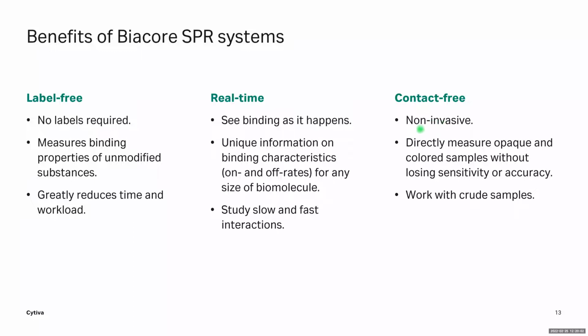We can work with fairly complex sample mixtures, samples that may be resistant to letting light pass through them, because for SPR to work, light only needs to be reflected. It does not have to pass through the sample.